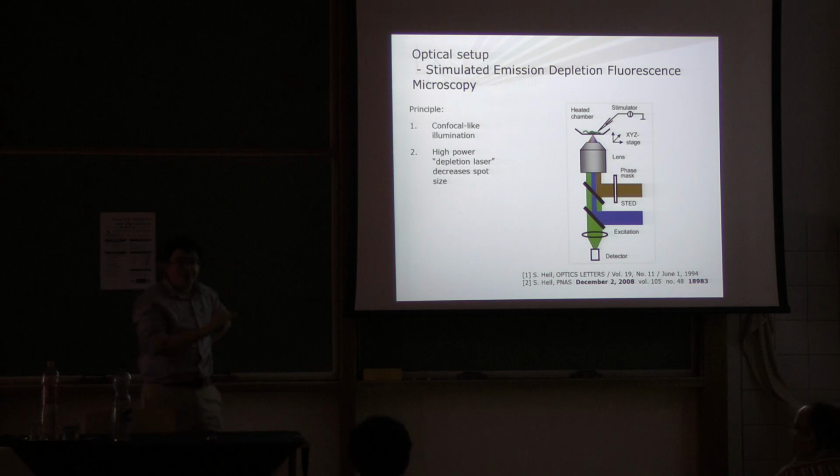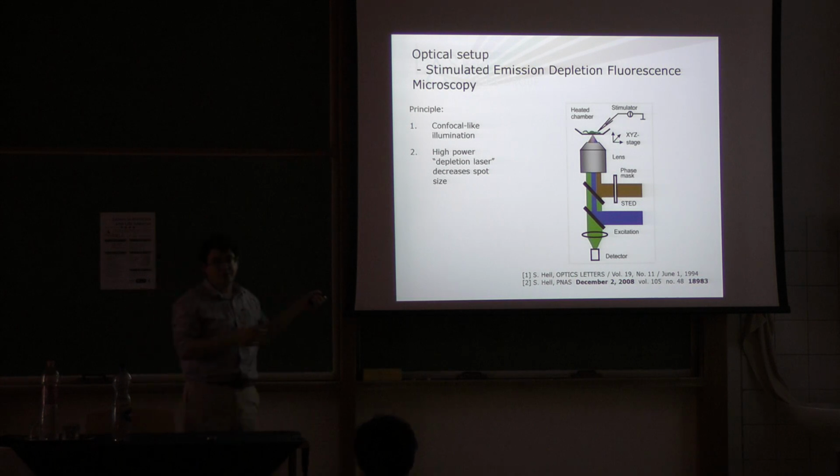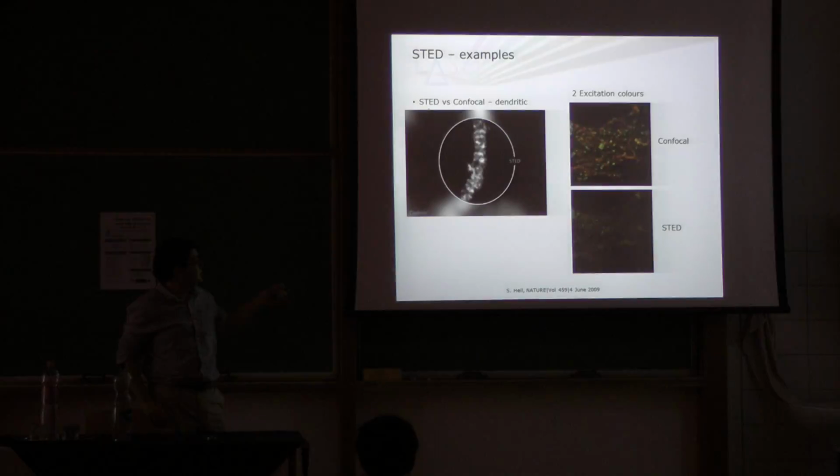also a confocal microscope itself is a bit more expensive than a wide field, but you need your confocal illumination optics for conventional illumination, and then you need this depletion beam, and you have to align the depletion beam to be perfectly centered and perfectly circularly symmetric, and you need to align it onto your sample. And then possibly you need some detector which has a time-gated operation, but you don't, because you can get around that in other ways. But regardless, in principle you need a high-power depletion laser, typically a Ti:Sapphire laser, so it costs money. But if you have that, then you can take nice pictures.